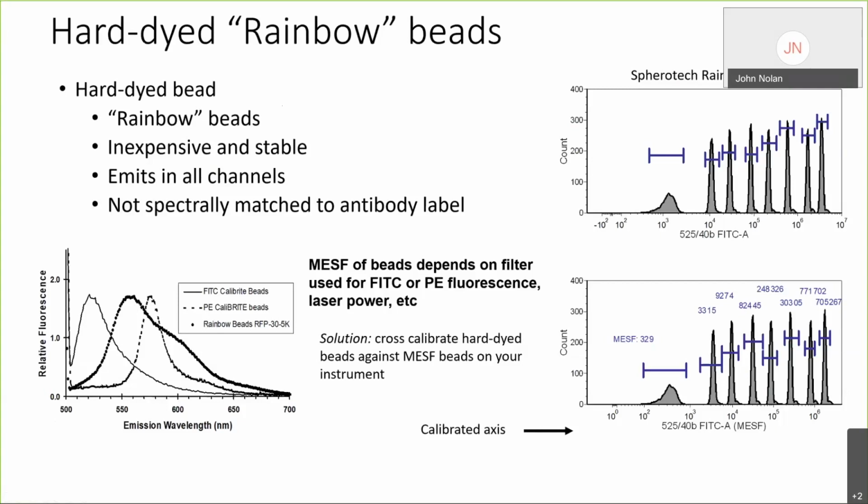So the calibrations performed with rainbow beads will be instrument specific. But a practical approach is to cross-calibrate your rainbow beads against MESF beads on your instrument. And you will have a set of stable calibrated beads for standardizing your measurements.